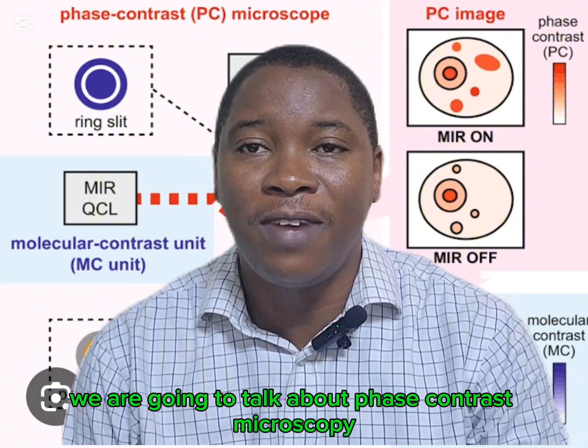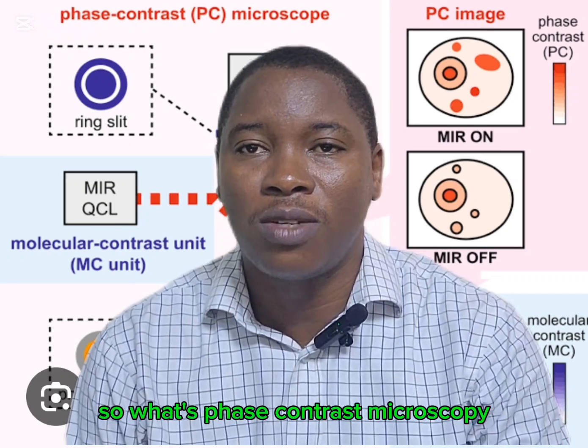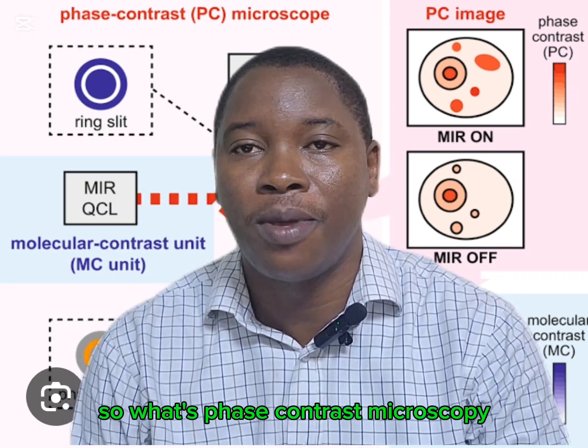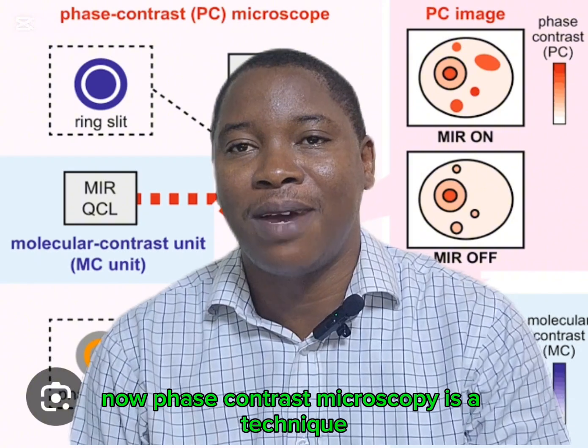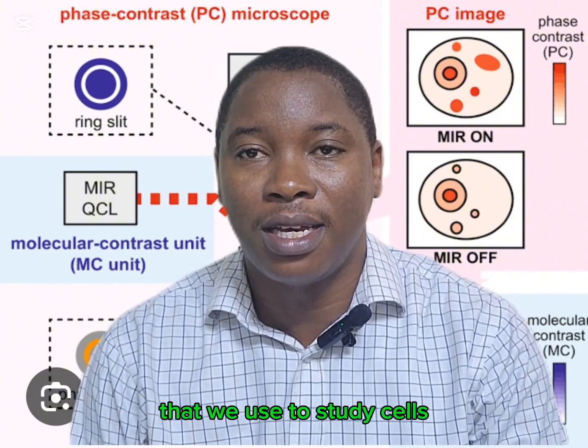Today we are going to talk about phase contrast microscopy. That's the second technique we are talking about. So what's phase contrast microscopy? Phase contrast microscopy is a technique that we use to study cells, living cells.